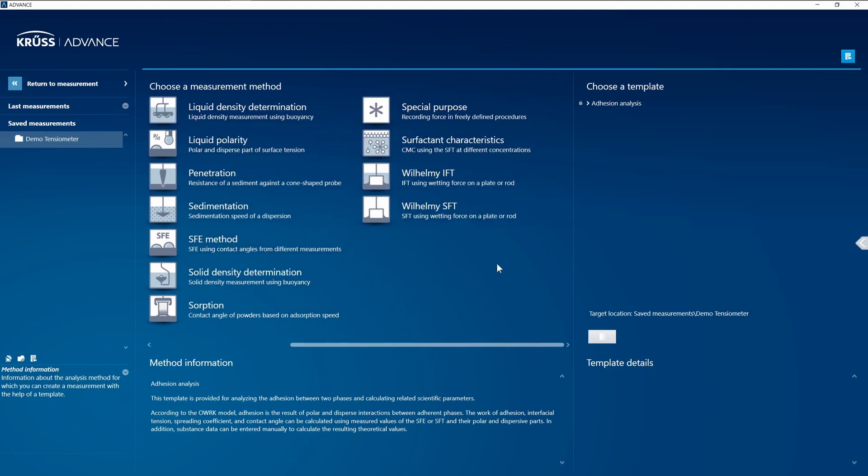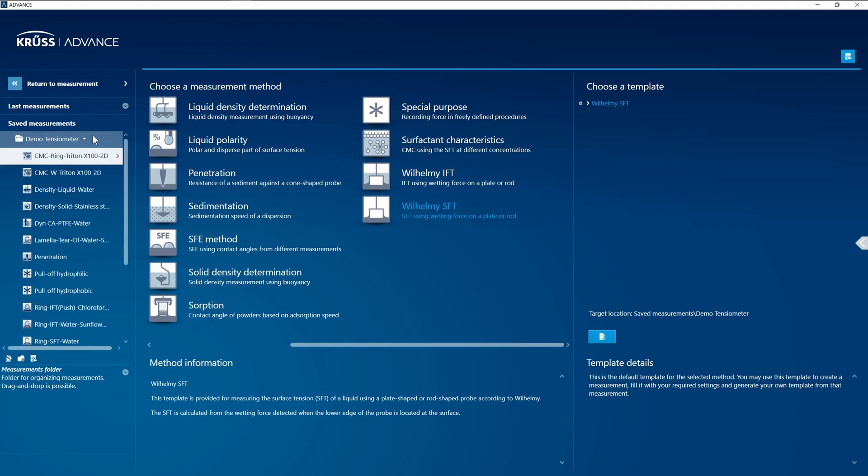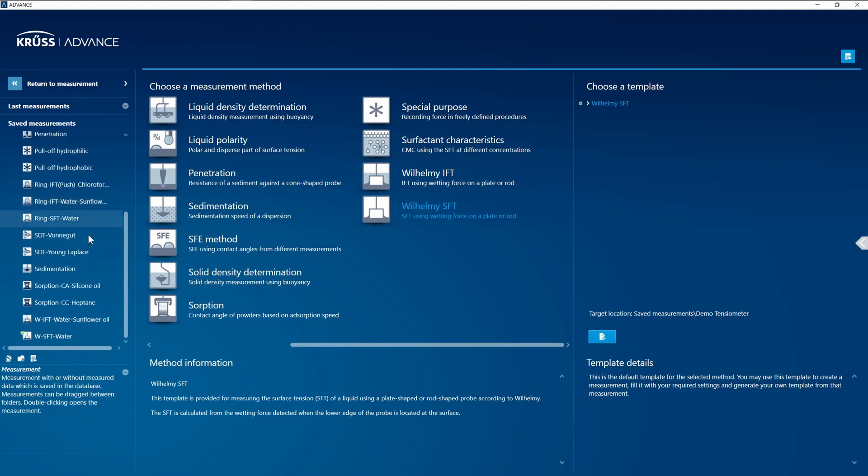In this case I want to look at doing a surface tension measurement, so I can click here, and I could open using a new template from this. This is just the standard template that Advance comes with. In this case I'd like to actually open an older measurement, so I'm going to go back into my folder here and down to a measurement I already made.